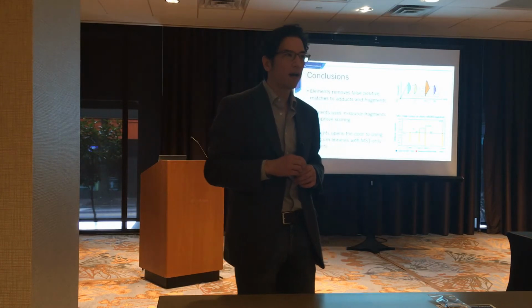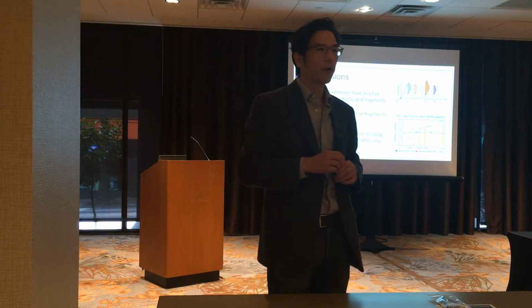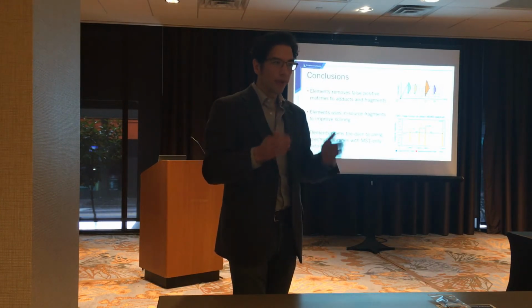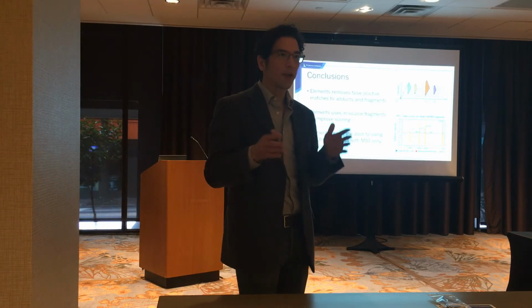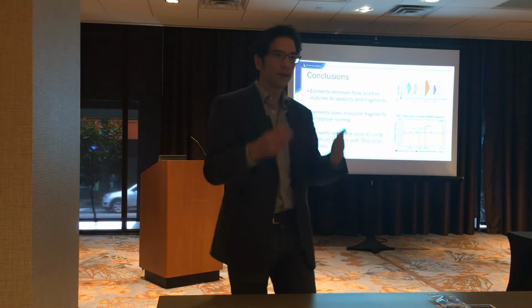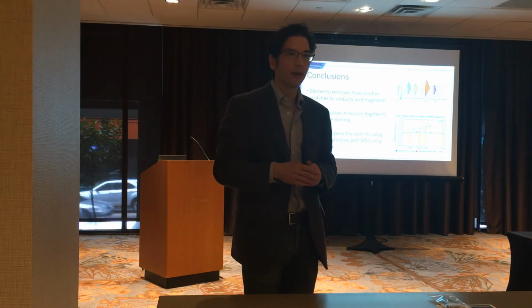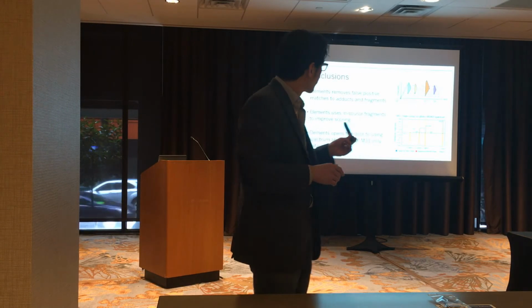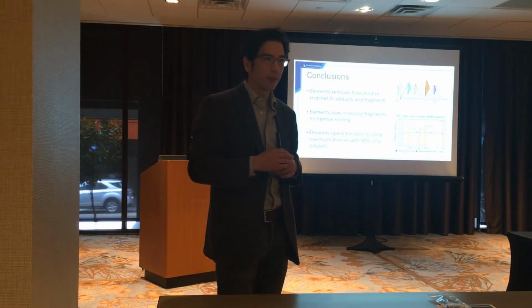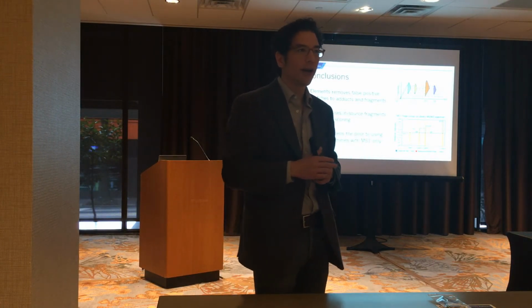So if you happen to have an Exactive sitting around, for example, without the quadrupole, just an Exactive, you could potentially collect really high quality MS1 only data at high res and potentially be able to make those detections for about half the price of a Q-Exactive instrument. We are pretty excited about this approach. And so if you're doing metabolomics, we think that you should be interested and want to try it out.